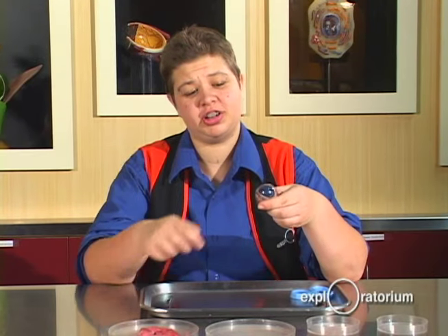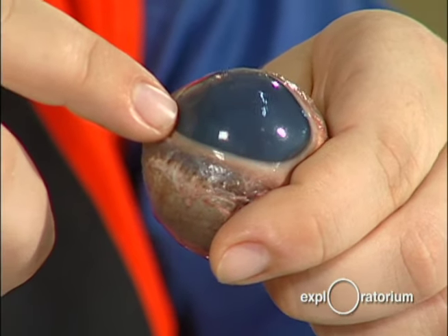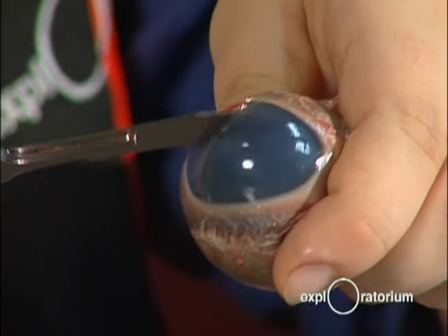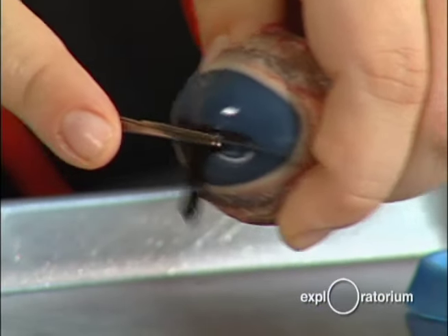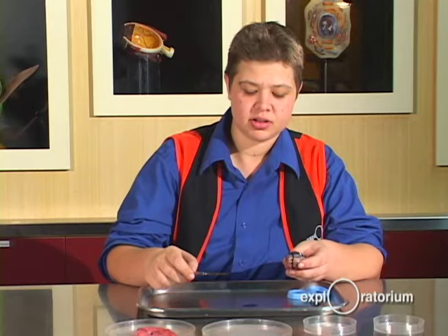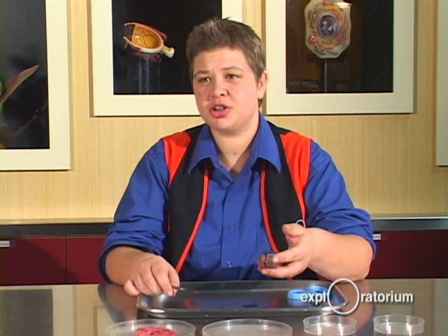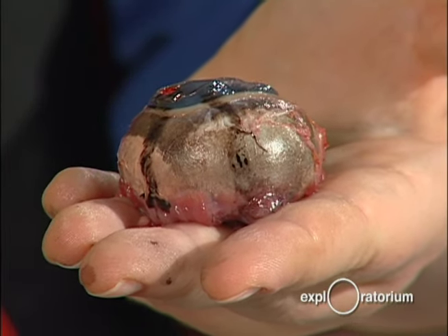Right here is the cornea — this is the protective layer of the eye, and light bends when it hits the cornea. I'm going to make my first incision in the cornea. What's going to come out is the aqueous humor. The aqueous humor brings nutrients to the eye, and as you can see my eye looks rather deflated — it also helps give the eye its shape by providing some pressure.